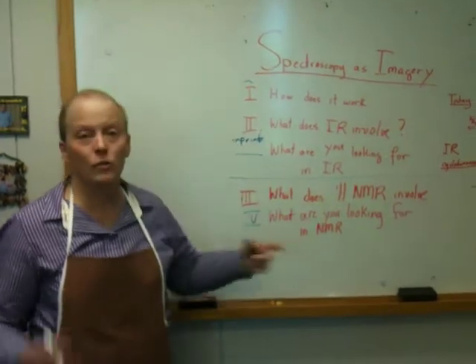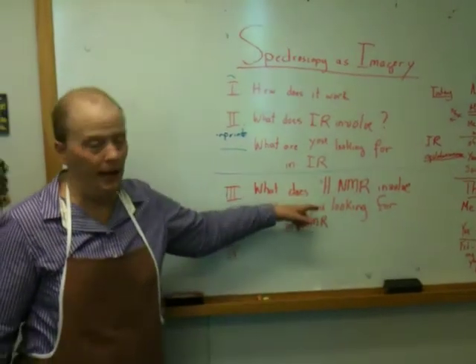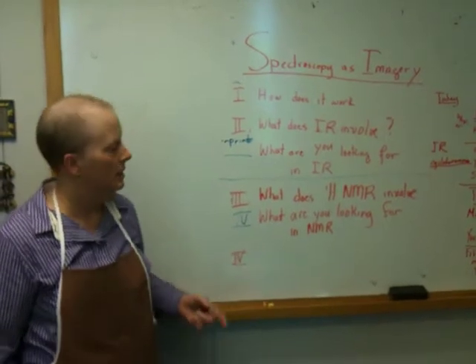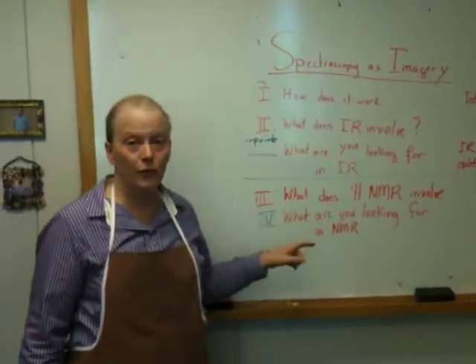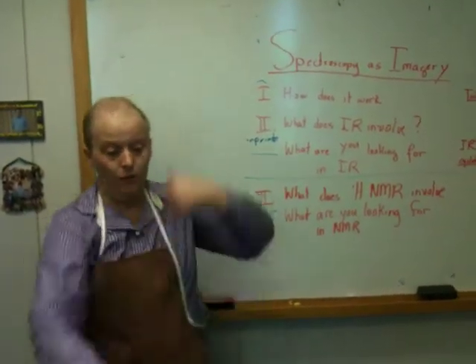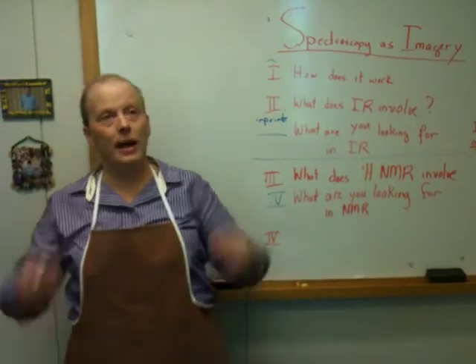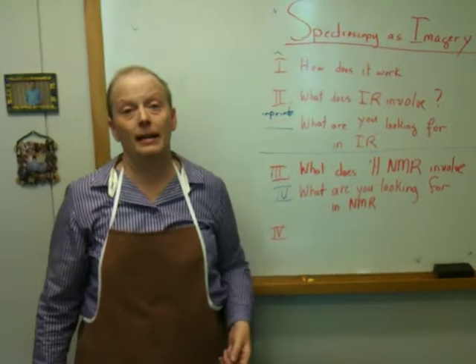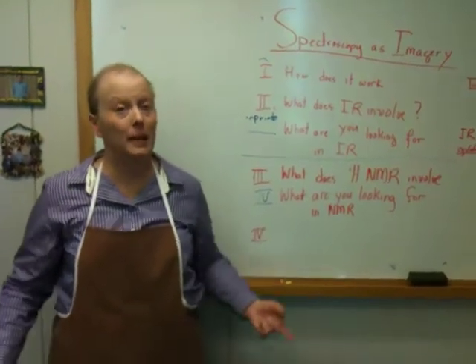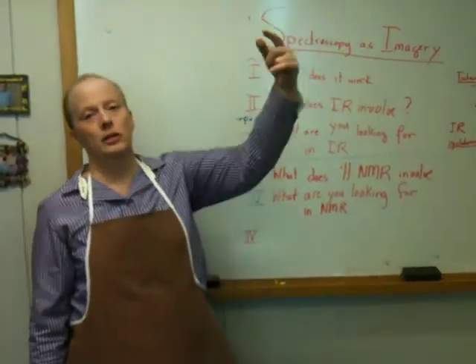Some of the hydrogens, which are little magnets, align themselves with the magnetic field. Most of them do that. And then some of them align against the magnetic field. What the experiment entails is putting in the correct radio frequency to make the hydrogens that are aligned in the favorable orientation flip over and go into the disfavored orientation. Then you take the energy away and the hydrogens cascade back down. So again, the magnet orders the little magnets, which are the hydrogens, and there are other magnets as well. The energy is radio frequency, and it pumps them up into a higher state.